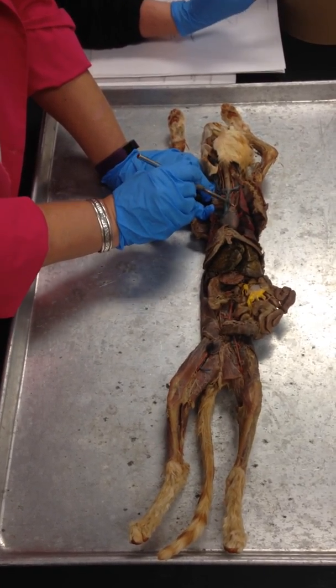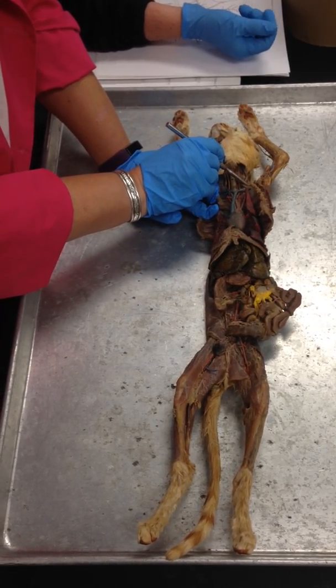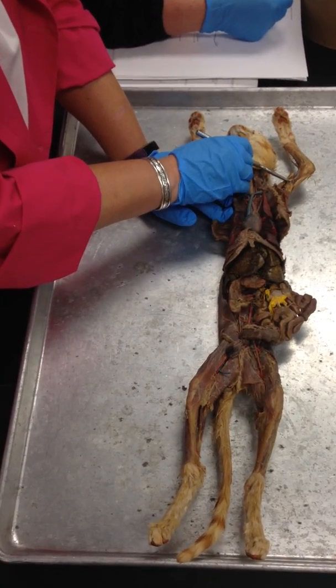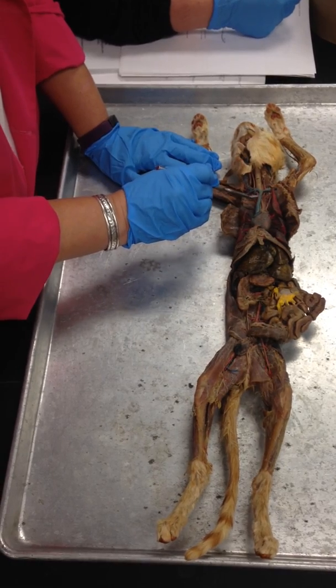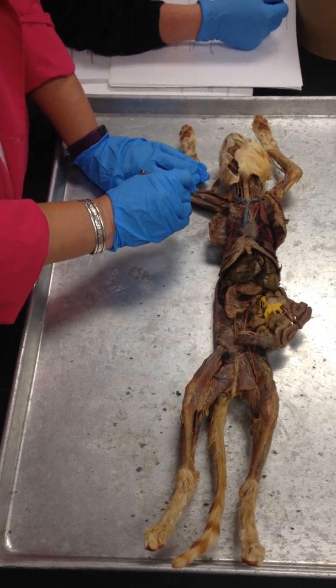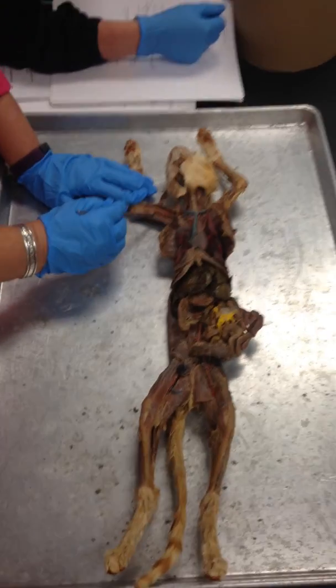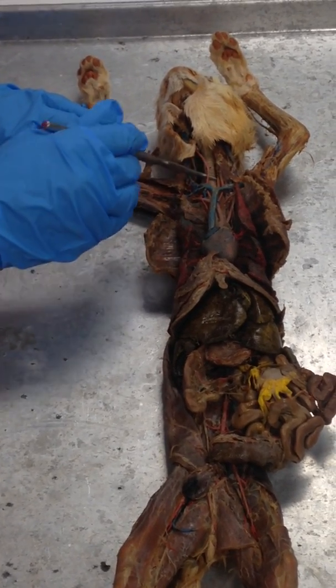In the left subclavian, if we go towards the left, once it hits the armpit, it's the left axillary. Well, that's easier. Okay, and then the left brachial. Okay, off of the brachiocephalic goes the right side. This branch right here is the right subclavian. Once it hits the armpit, it's the right axillary and then right brachial. Okay, and then these two things right here are your common carotids.